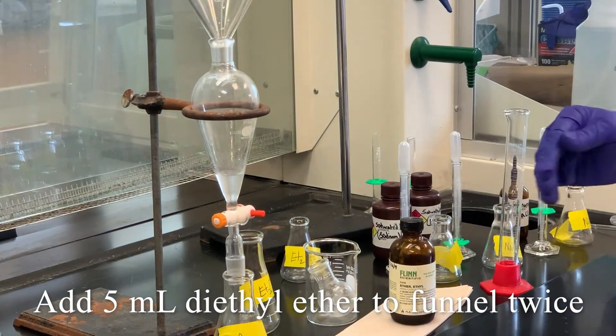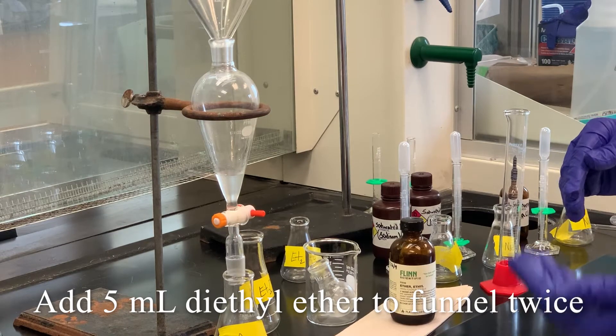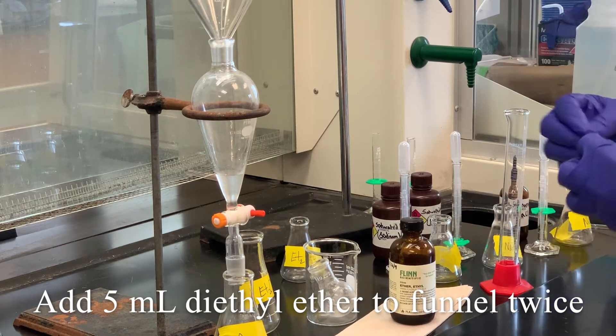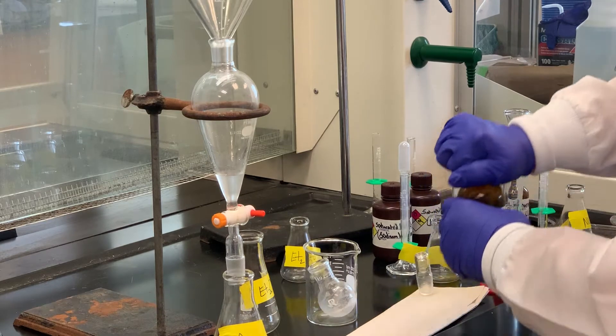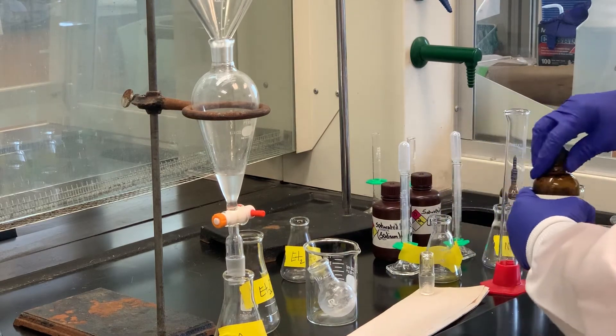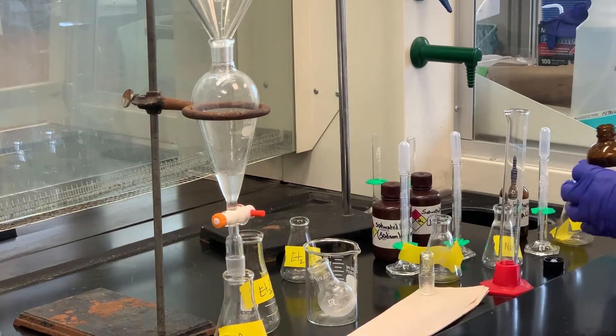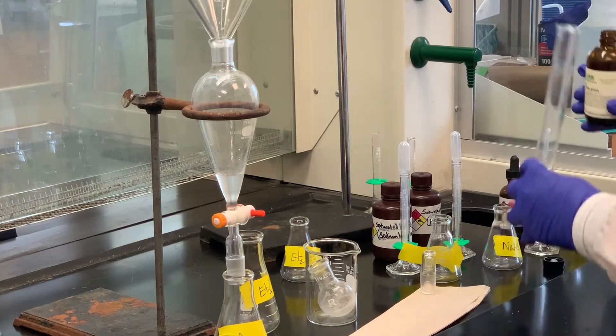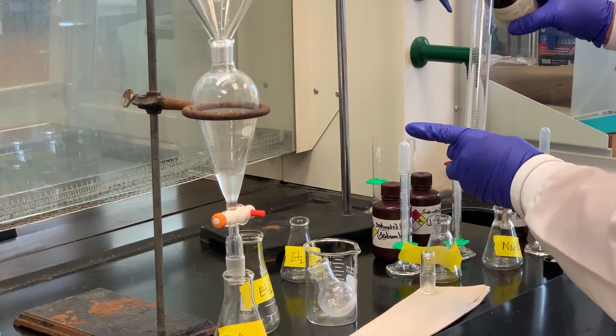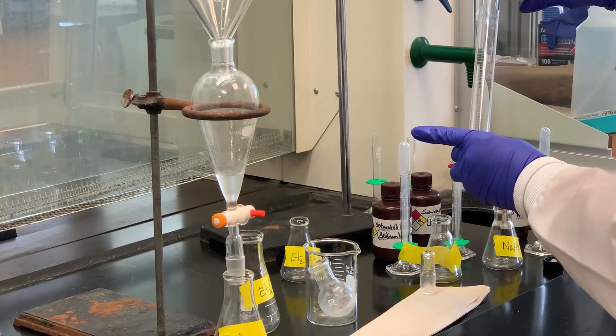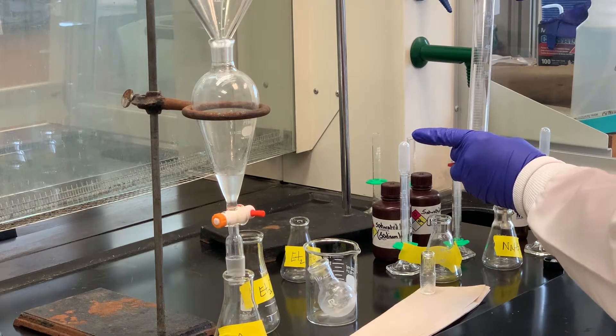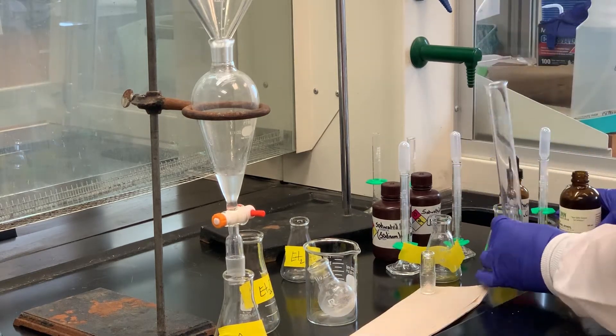Separate the layers. I want to wash that aqueous layer a second time with the ether and then combine the ether extracts together. So I'm going to measure out five milliliters, and if it's more than five, remember we're going to get rid of all of this. So if I add more than five, it's not the end of the world. That's close to five there.